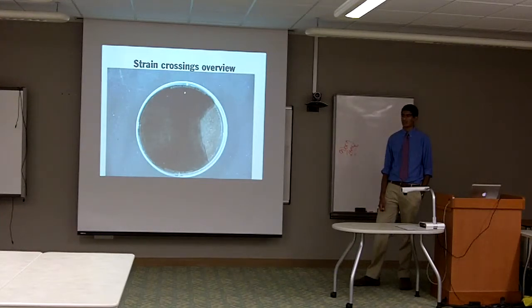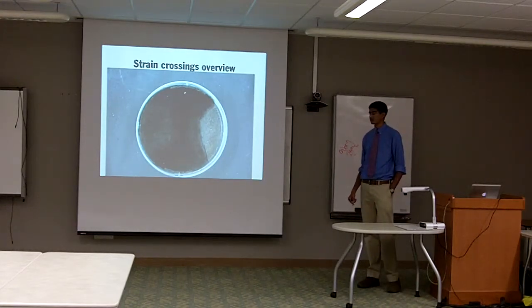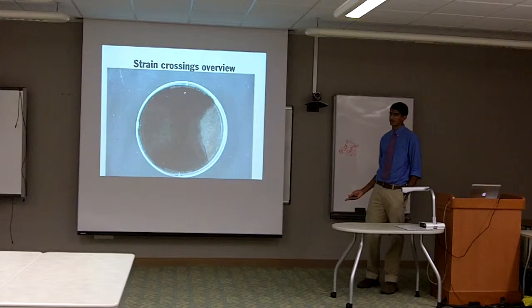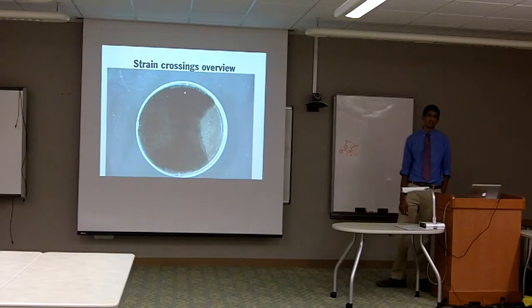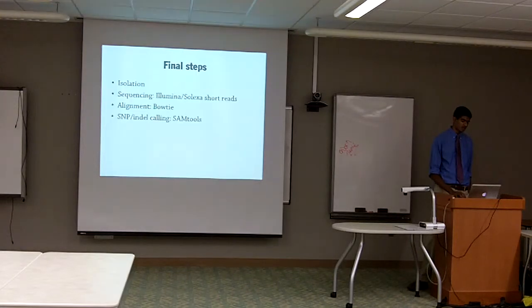Because remember that the recombinant perithecia, the perithecia that are the offspring of the two strains, are going to be formed on the contact line. And they're the rightmost perithecia that can still fire spores, because the PER43 perithecia can't fire spores at all. So basically what I do is I scrape off the rightmost spores, right along here, plate them on germination medium, allow them to germinate, and then I can cut them out individually, grow them up, and see which ones have the mutation. And that's how I went forward with my process.